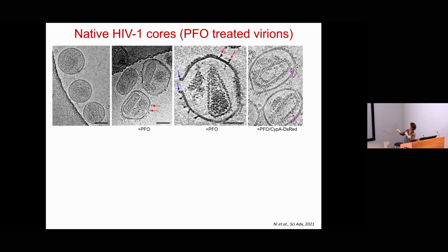You see, this is a pre-pore formation, the two protein bound. But when they change conformation, they make about 40 nanometer holes. And these holes allow all those soluble proteins, the unassembled CA, to leak away, and we have a great improvement of contrast, so we can get a higher resolution structure on this.